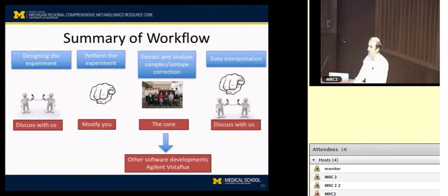One occasion is when you don't want to subject your cells to a full media change, and you want to do something gentler, like spike in a 13C isotope and just watch what happens without a media change. So there are occasions when you may be dealing with a mixture of tracers, such as mixing 13C glucose and glutamine in the same dish. Generally, I recommend first doing a parallel labeling study with individual tracers before you start trying to interpret data that comes from putting multiple substrates in at once. But yeah, hopefully that answers your question.